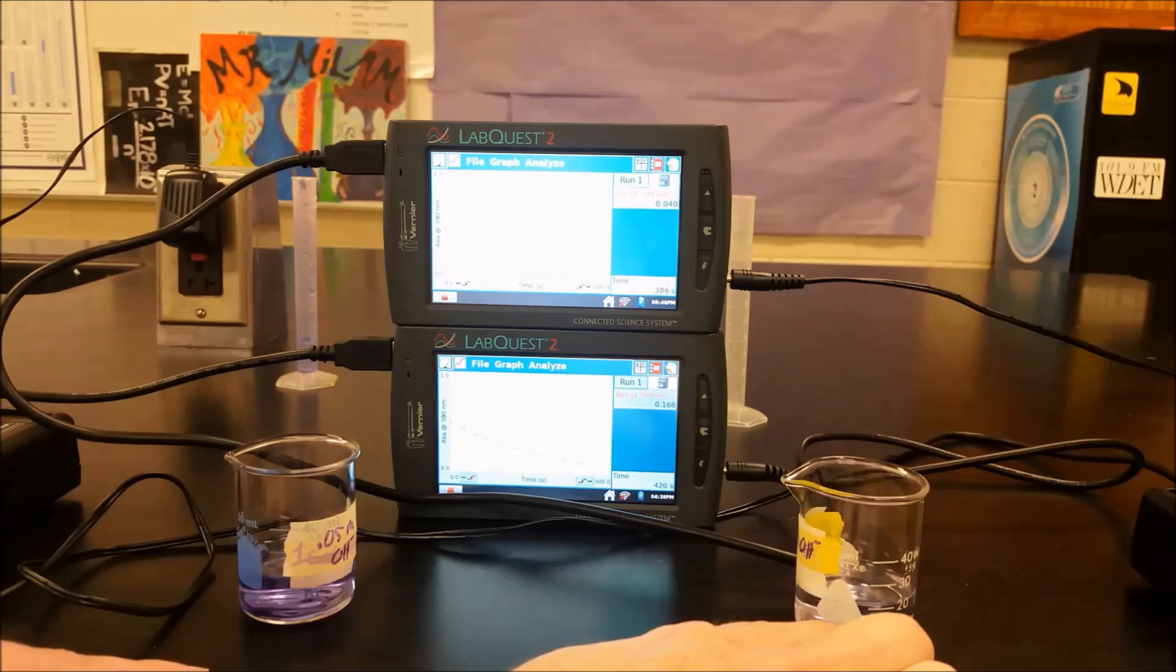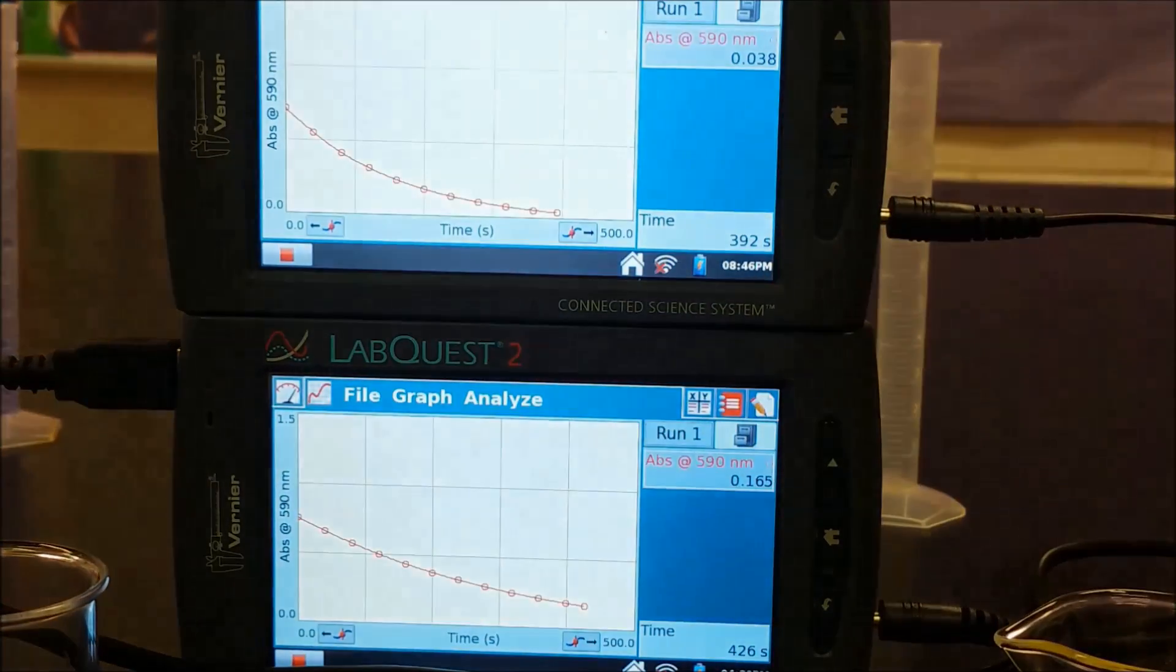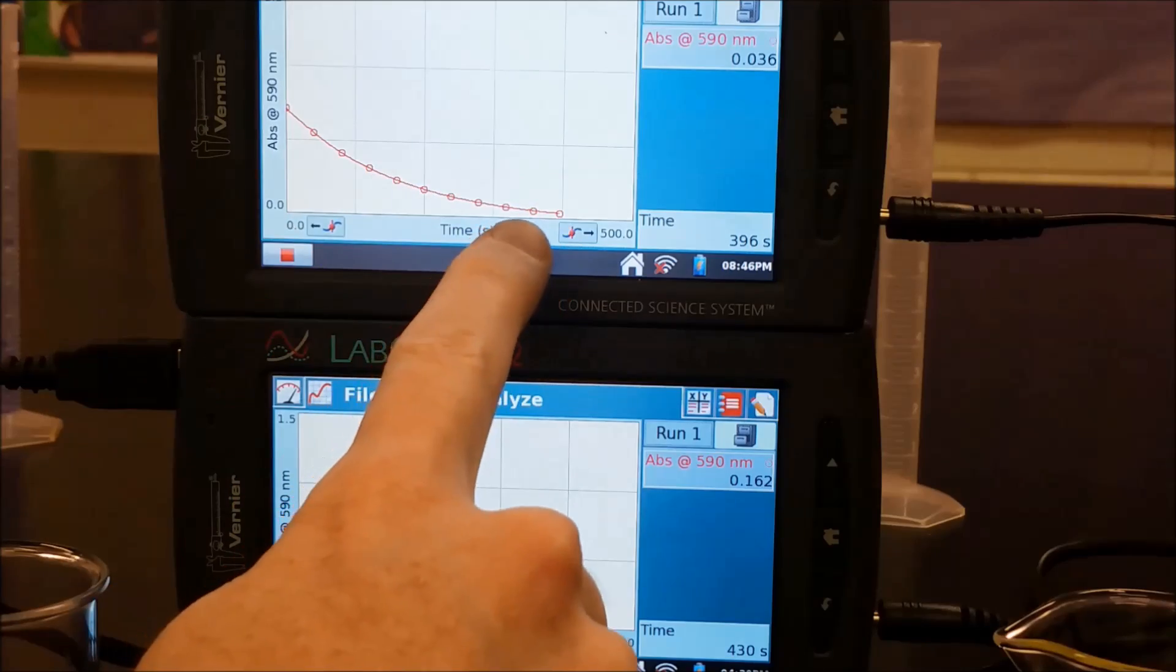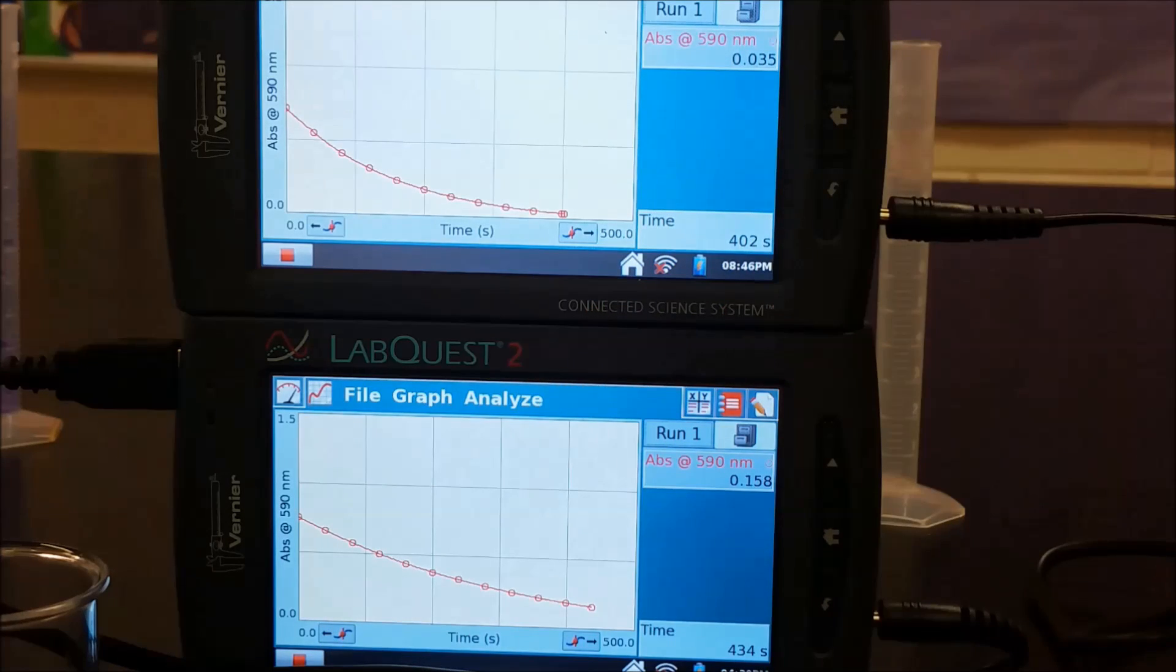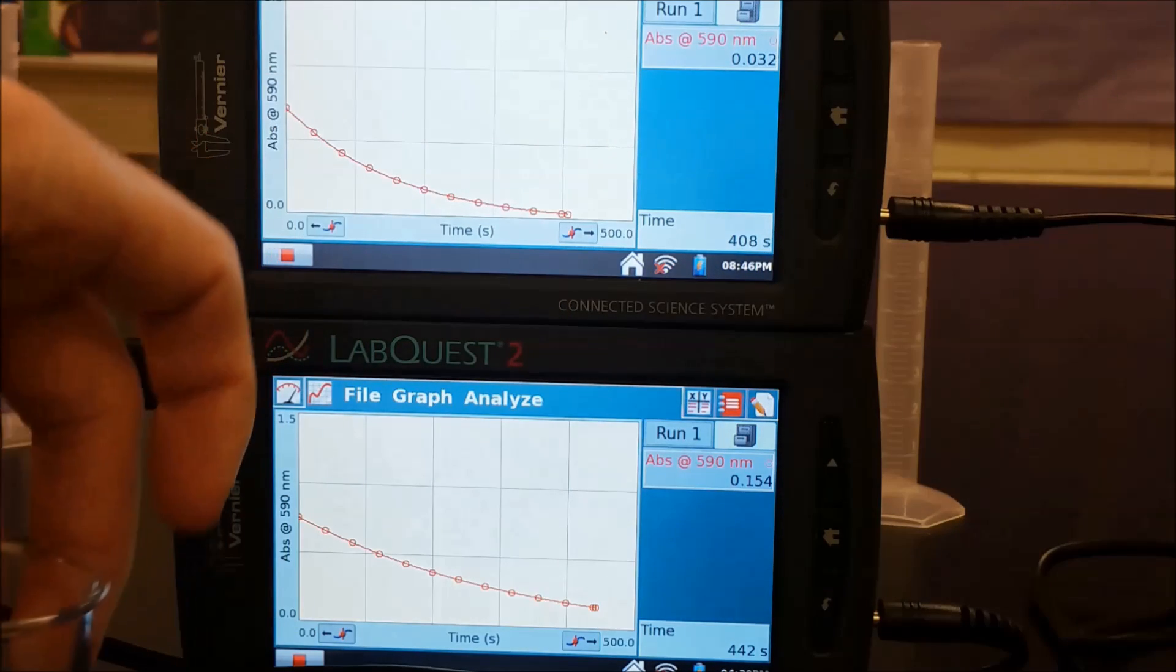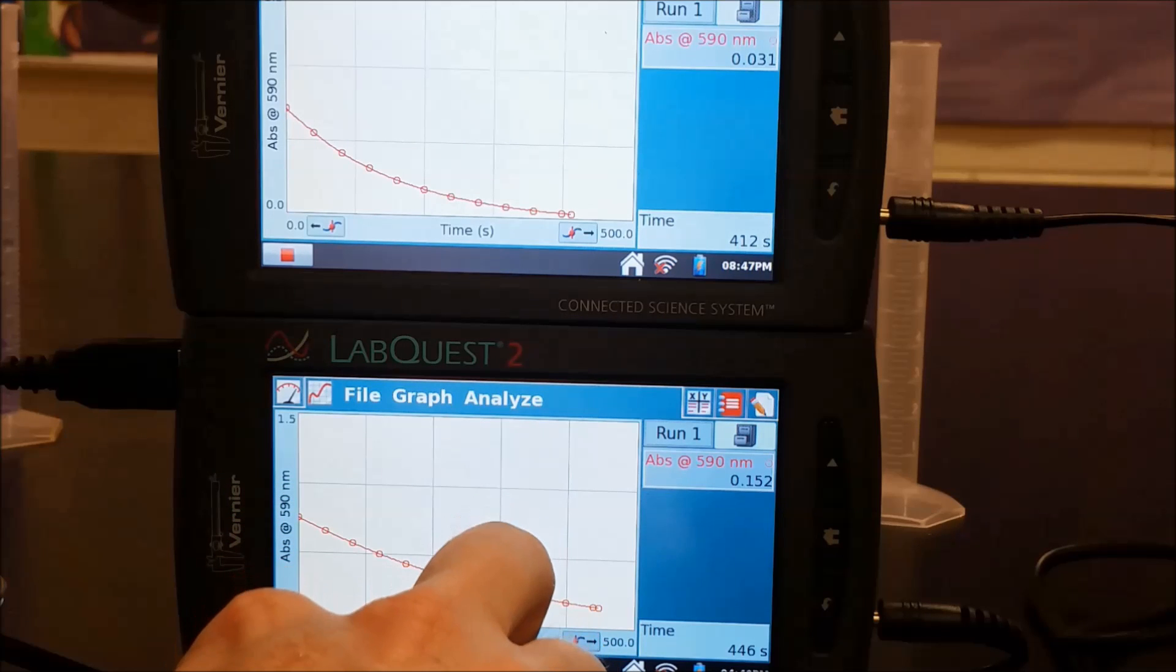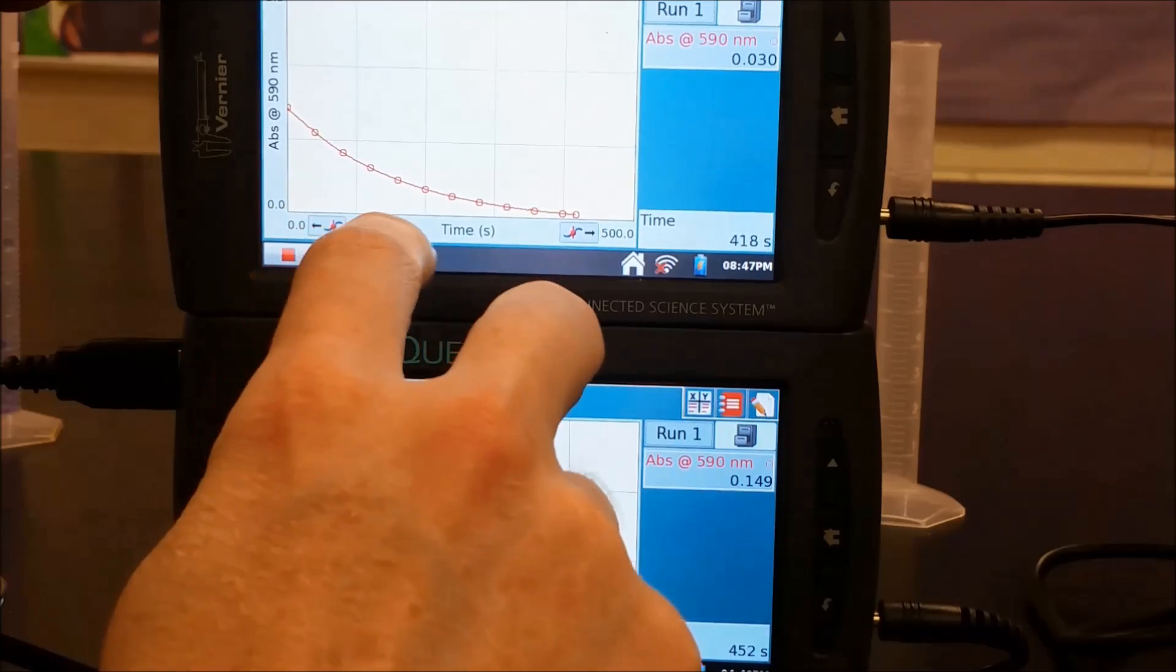So if we look now, we see that this one has reacted significantly more than this one has, and so we can see that on our graphs as well. So here we've seen that this is mostly reactive, that's the solution right here which has now gone to pretty much colorless. And this one is reacting much, much slower as the hydroxide concentration was less, and so we can still see a purple hue to that a little bit although it is lighter. So we can go ahead and stop these now and run our analysis.